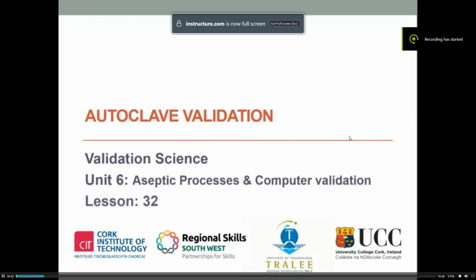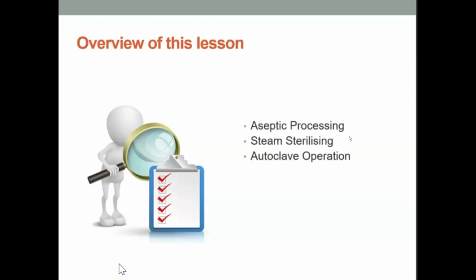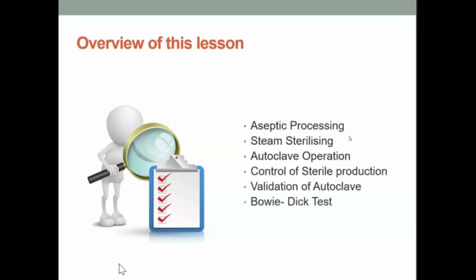Welcome to Lesson 32, Autoclave Validation. In this lesson, we will be looking at aseptic processing, steam sterilizing, autoclave operation, control of sterile production, and the validation of the autoclave, including a Bowie-Dick test.